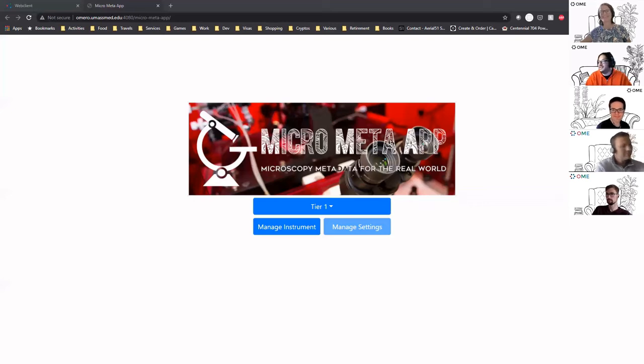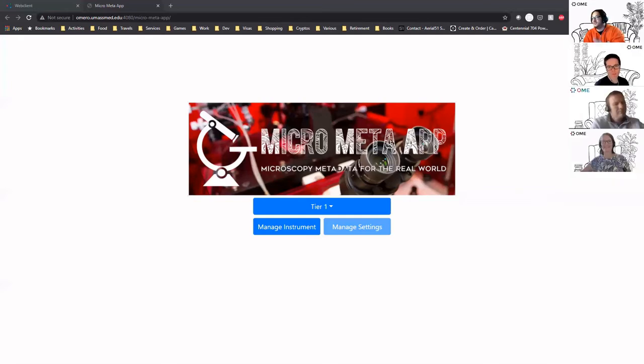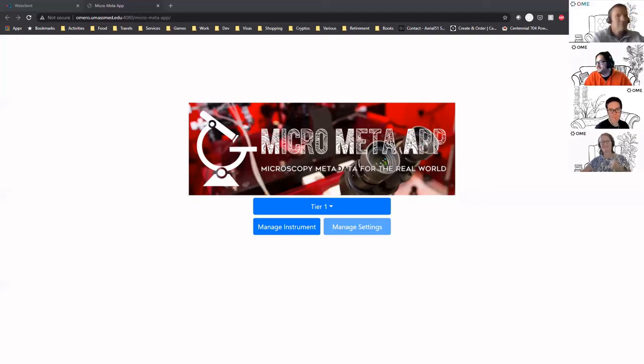So, but yeah, ideally it wouldn't be that difficult to go from here to, okay, let's build a database of all the components if everyone is collaborating. Yeah, Jean-Marie? You mentioned Excel spreadsheets earlier, so people record that in Excel spreadsheets. Does the tool allow you to take Excel spreadsheets and convert them, or what will be the process if people have already spent hours and hours entering that in Excel spreadsheets, do they have to redo it?